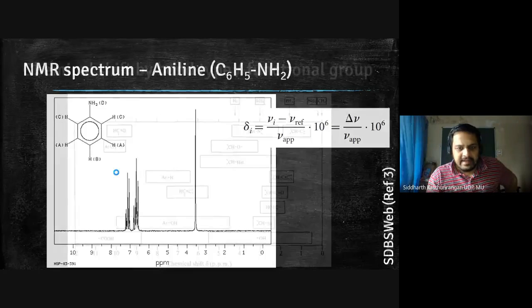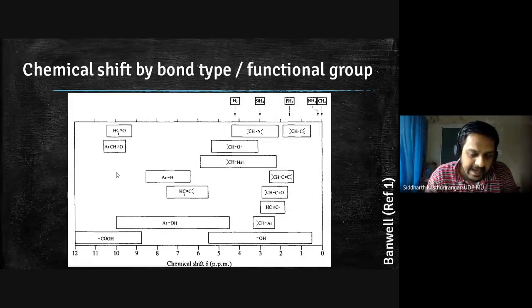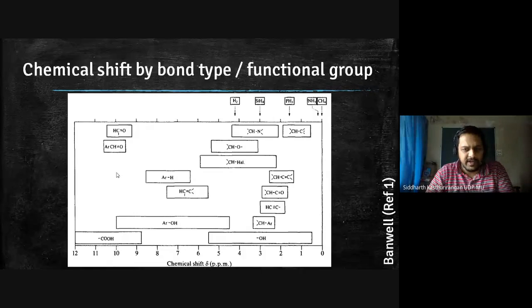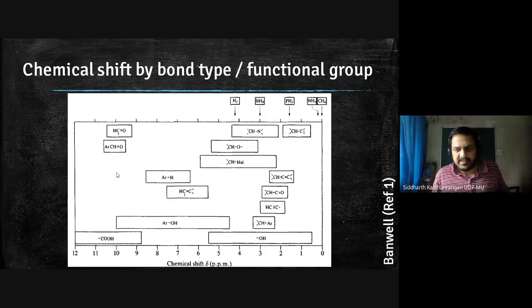So the NMR plus the IR can usually help to clarify completely what type of compound you are dealing with. And if you combine this with the total mass of that particular compound, then you can also zero in on what its actual structure is, because once the mass is known, you know the limitation on the number of atoms, etc.